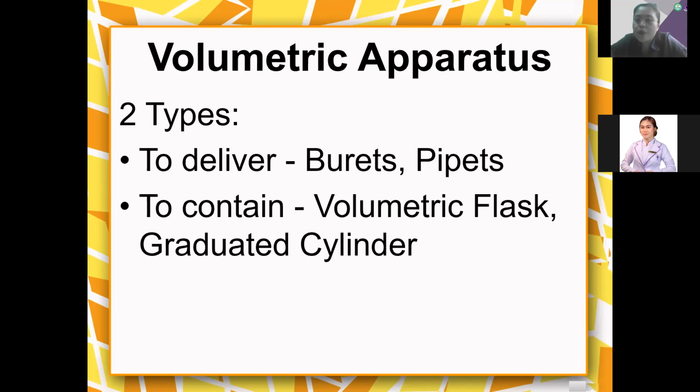And then also our graduated cylinder. So parati natin itong ginagamit in the laboratory when we measure volumes of liquid. So it can contain also our liquid, but at the same time, we can transfer it to another container. But ito lang ha, ito lang yung mga volumetric apparatuses natin.